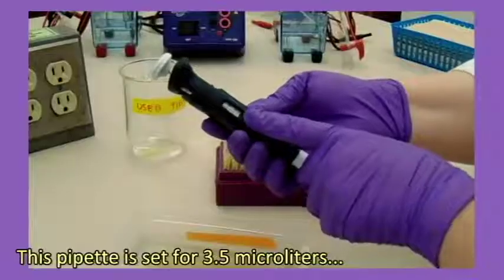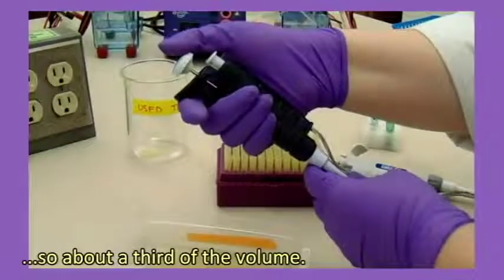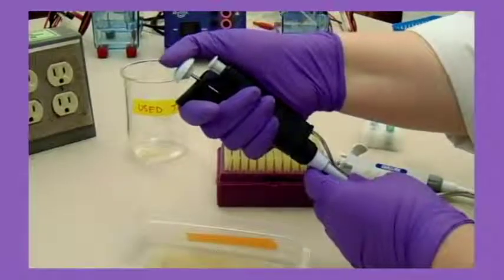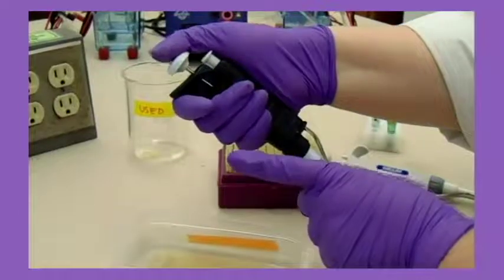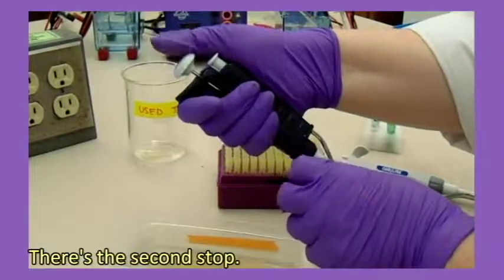This pipette is set for 3.5 microliters, so about a third of the volume. There's the first stop. There's the second stop.